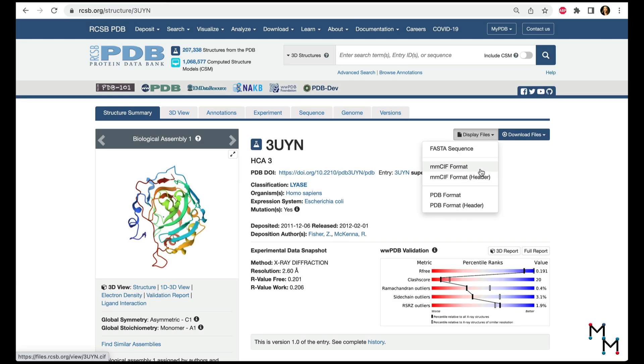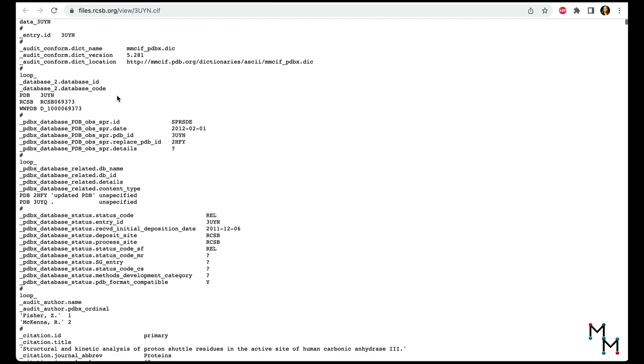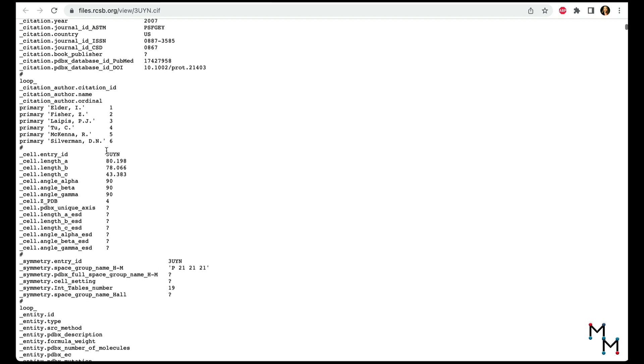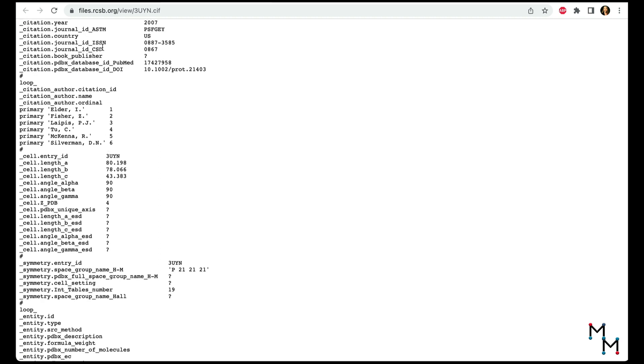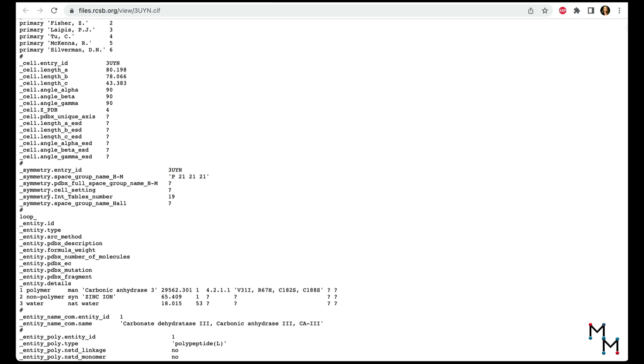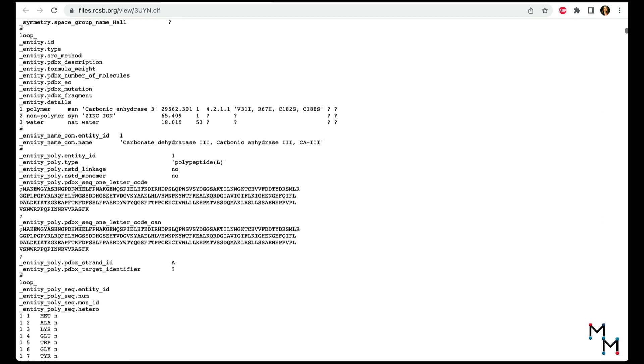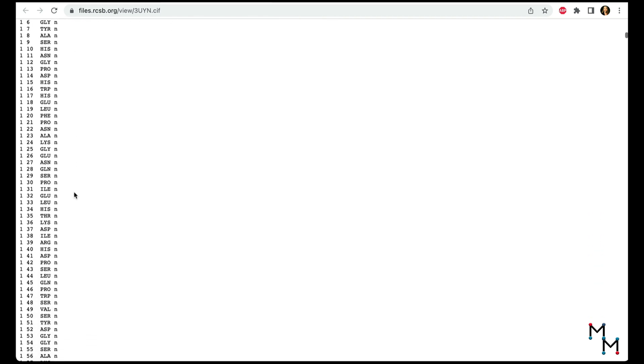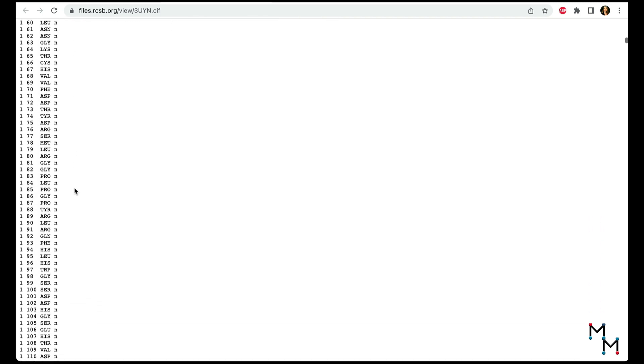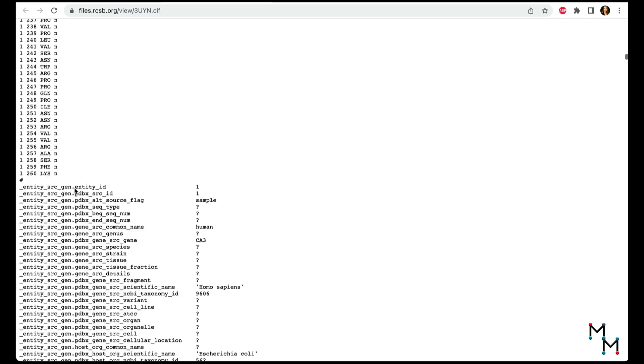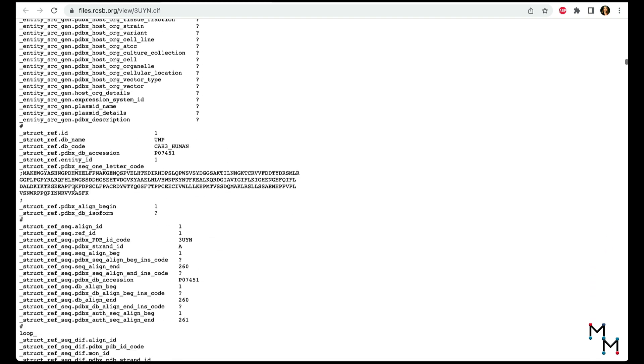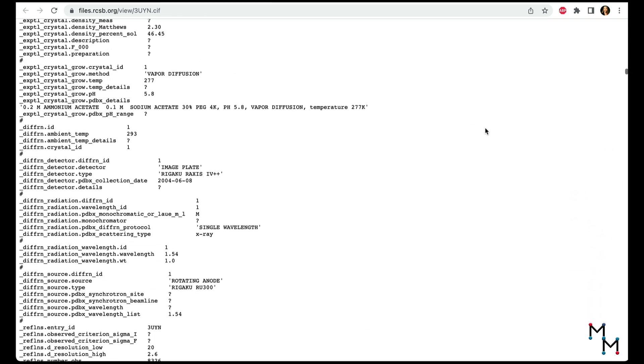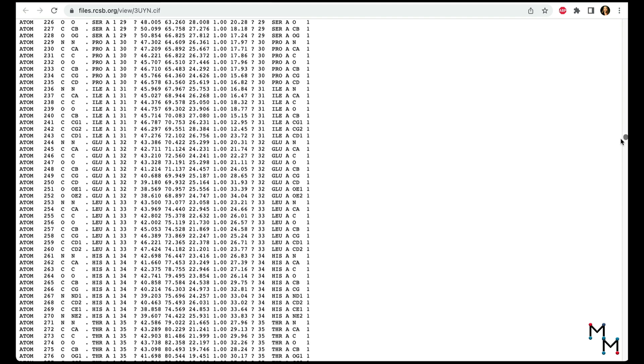From the RCSB PDB page, let's view the CIF file for the structure. We've got some general information about the citation first, some structural information that PyMOL reads to set up the cartoon renderings, and near the end, the file gives information about the 3D coordinates of each atom in every residue of the structure. That's all PyMOL needs to create great images.